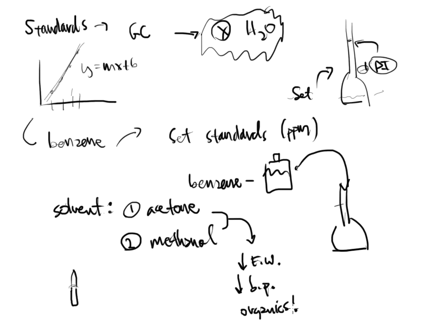So I would take some benzene, add it to a flask, and instead of adding DI water to it, I would just add acetone up to the line, then invert and mix, and now I've prepared my sample. Or if I didn't want to add acetone, I could add methanol instead, and it would do the exact same thing that acetone would do.